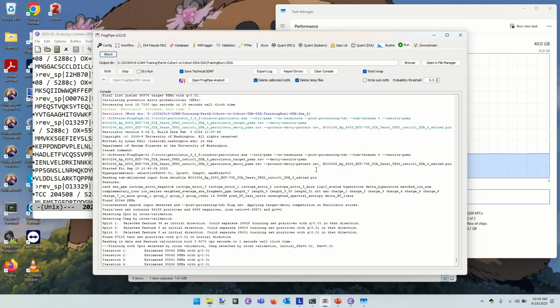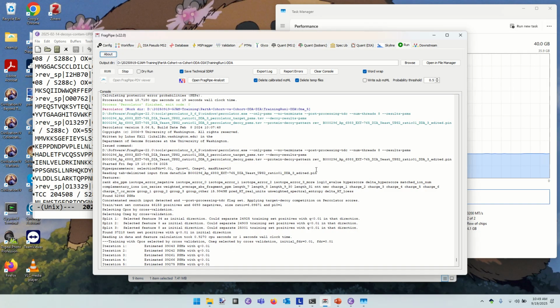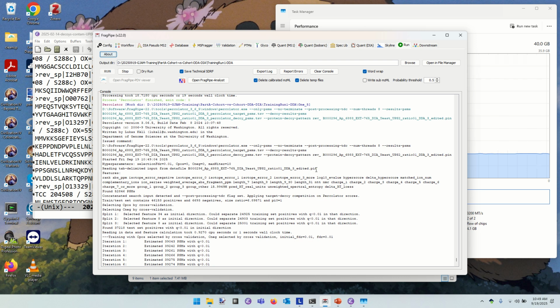Is it still barking? It's doing something. Okay, well, maybe it will run.